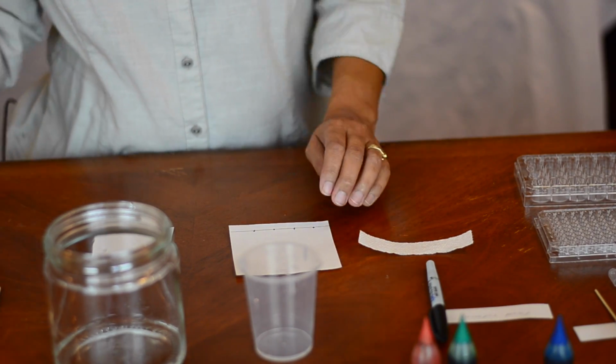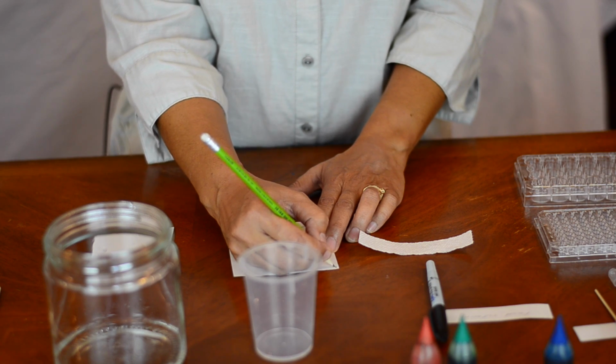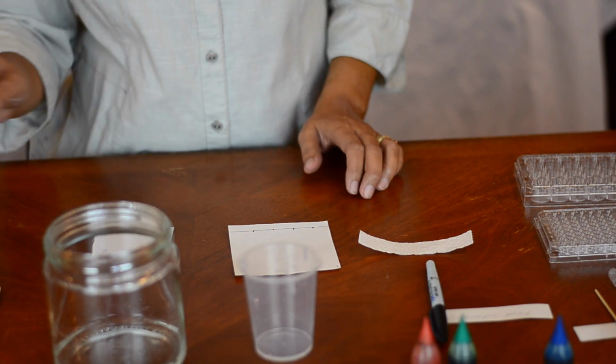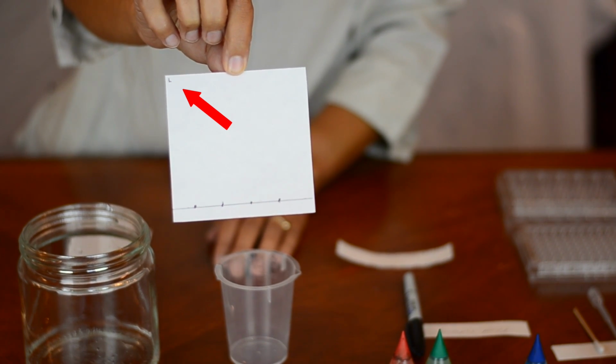And I'm also going to put a little tick at the top corner on the left-hand side of my paper. I've just put an L because once this gets wet, I'm not sure what's going to happen or how the paper will appear. So this little L at the very top will hopefully help me keep my bearings because the paper is going to get pretty wet. All right, so our paper is all set and ready to go.